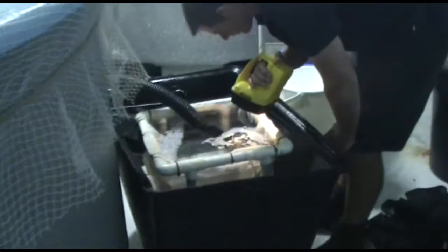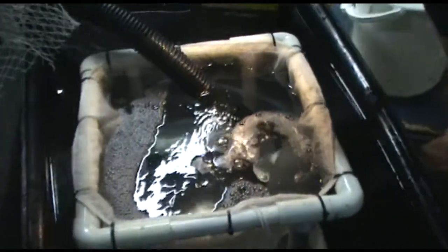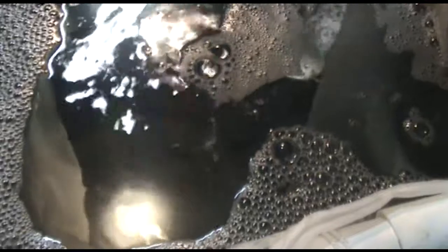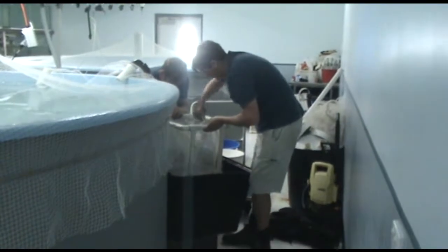From around 48 hours post induction, check egg baskets at regular intervals for a spawn. Eggs are easy to spot with a torch. Concentrate spawned eggs by partially lifting the egg basket out of the water.